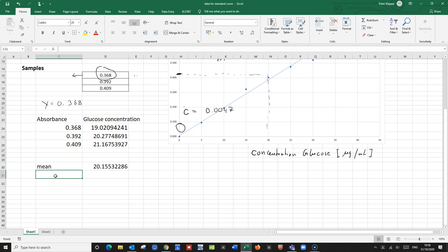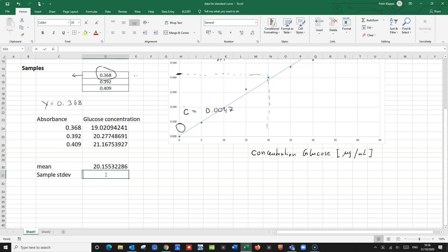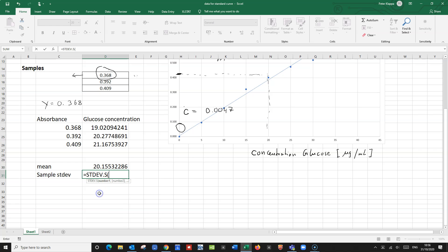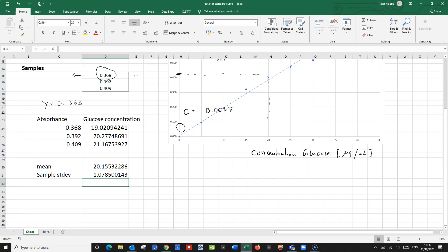We can also calculate a sample standard deviation. In Excel, that is STDEV, and for a sample standard deviation we need STDEV.S — that's the sample version. We highlight the numbers and close the bracket. So we have a sample standard deviation of 1.08.